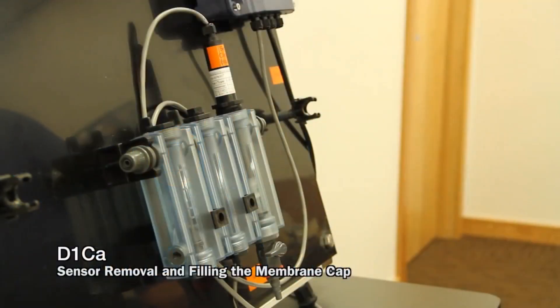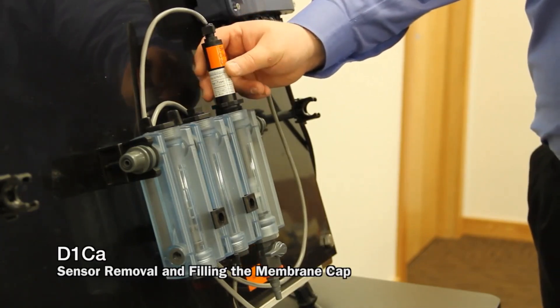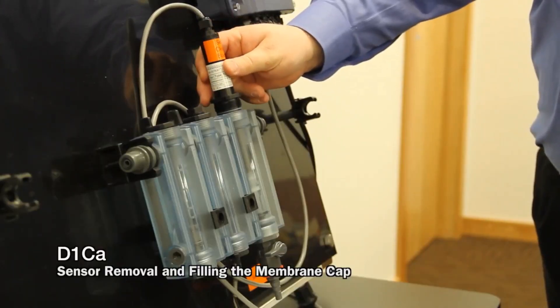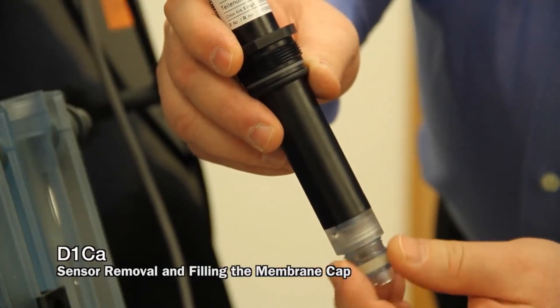This section shows removing the sensor from the sample line and filling the membrane cap with electrolyte. First, be sure that there is no flow in the sample line. Then loosen the compression fitting holding the sensor in place and remove the sensor from its sample cell.